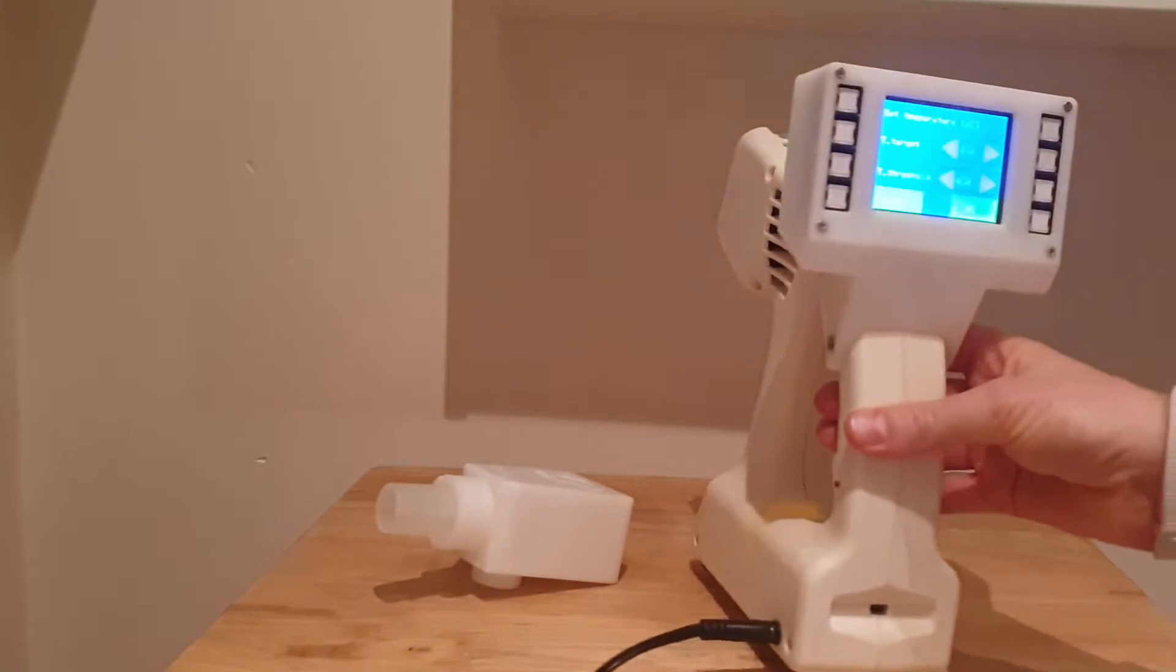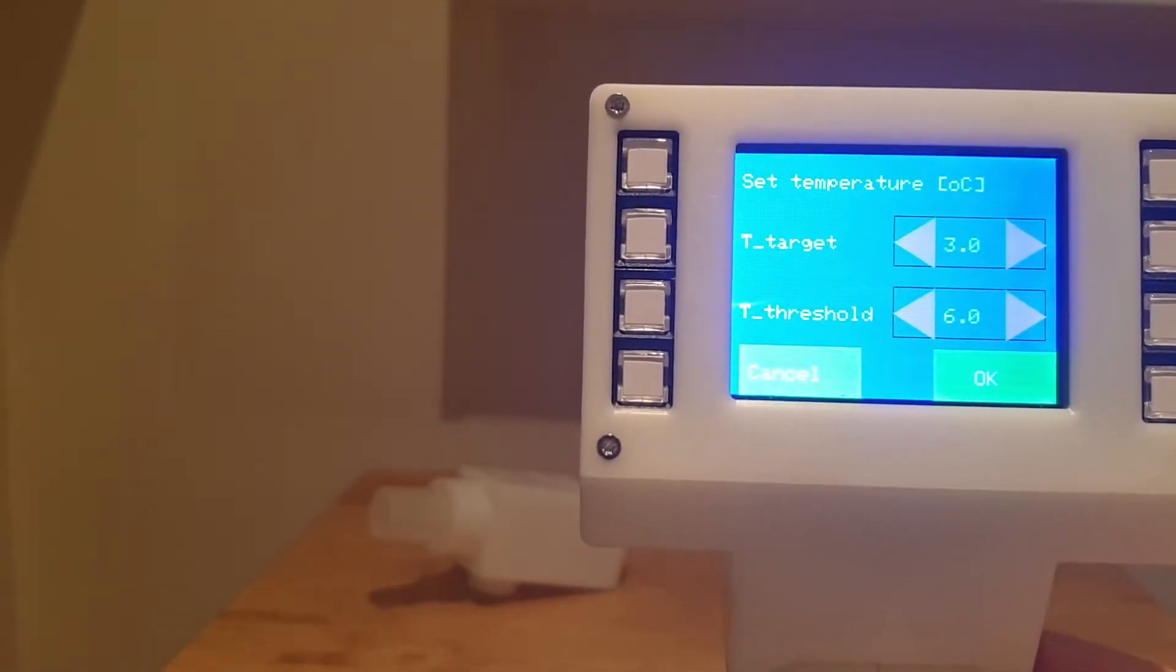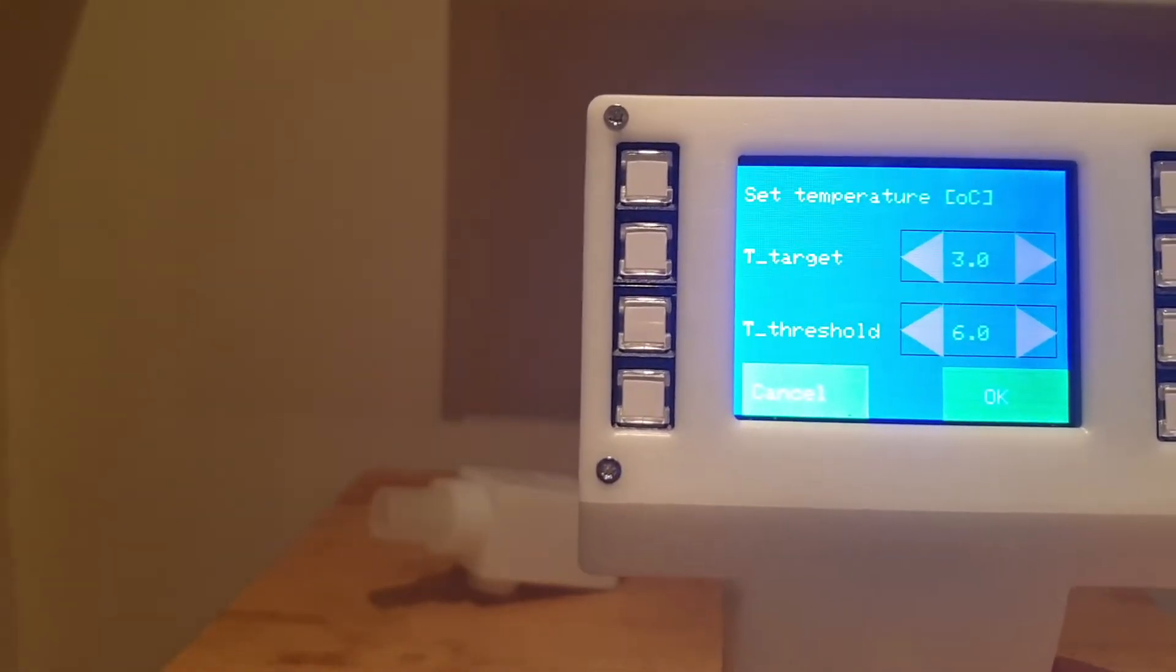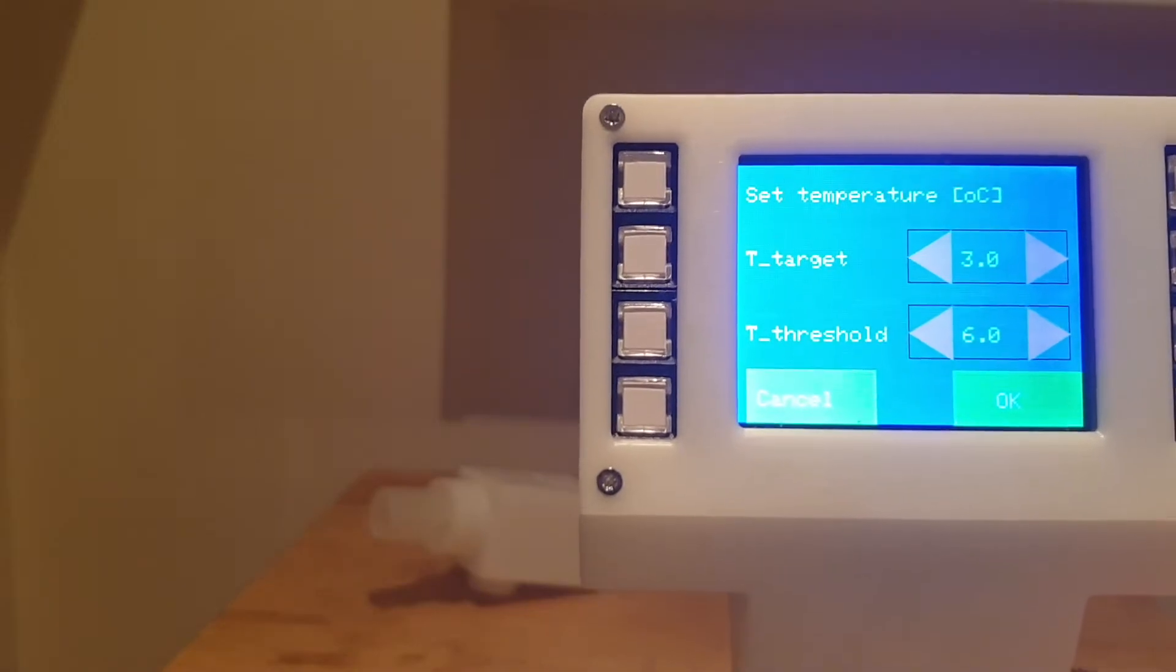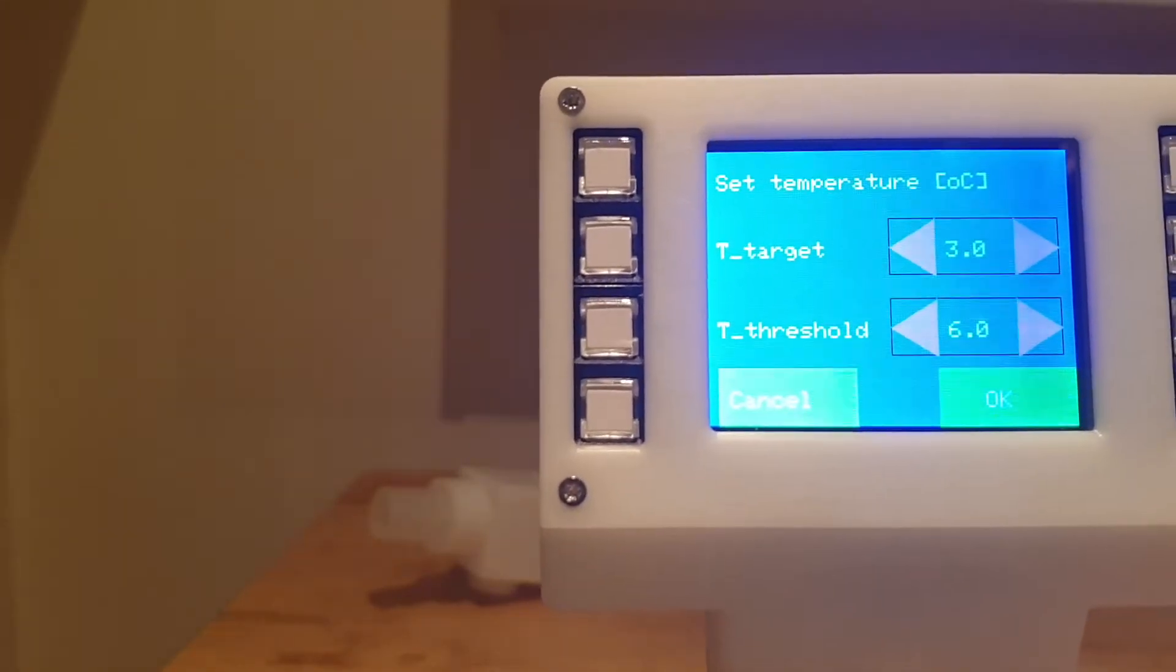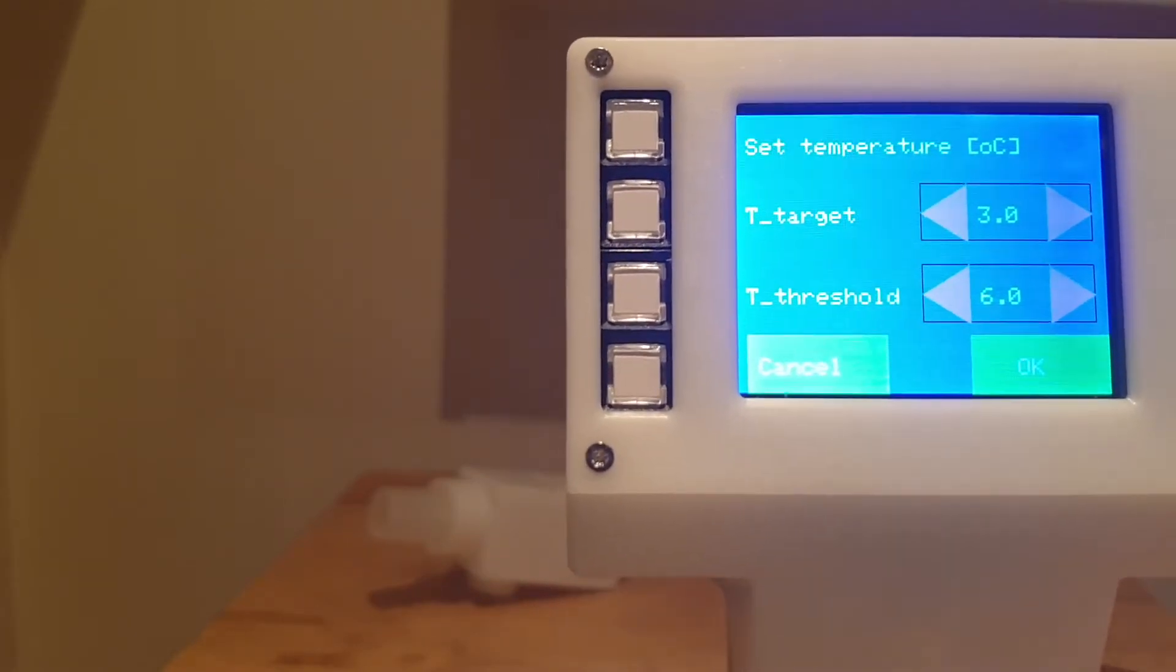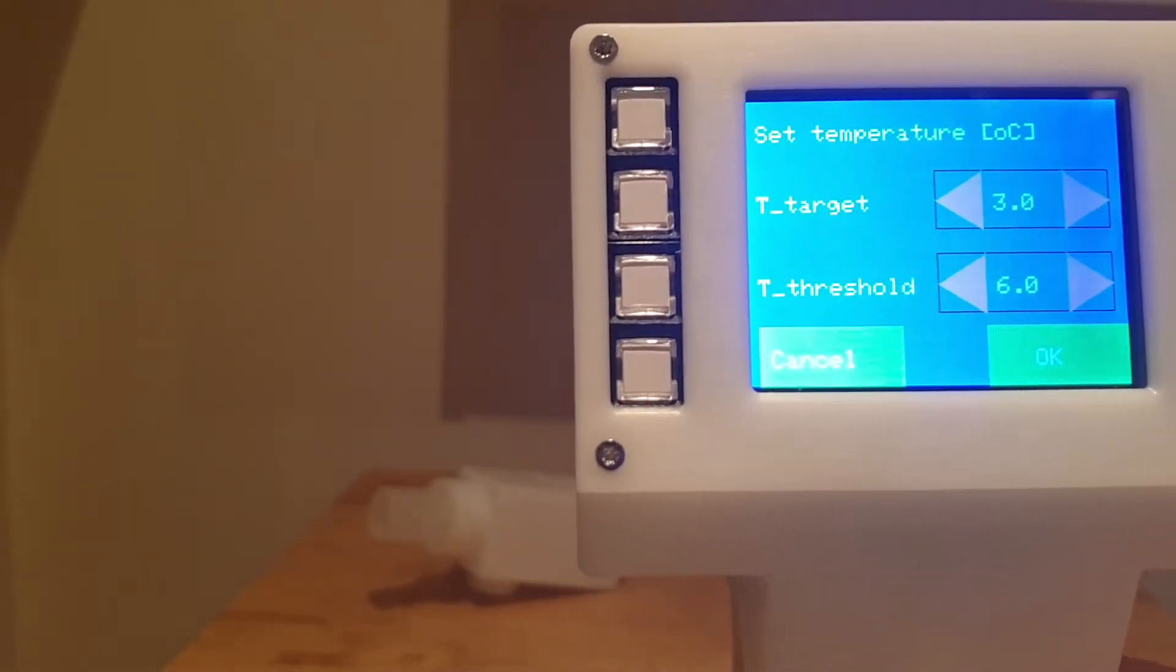What this is doing is it's actually asking me, I want to sample the environment. I specifically want to sample the vapor phase because molecules like hydrogen peroxide, they're not necessarily in the gas phase. They're in vapor that's carried in the gas phase but they're strictly speaking in the vapor phase. So we need to actually condense them. To condense them we have to get to their dew point.